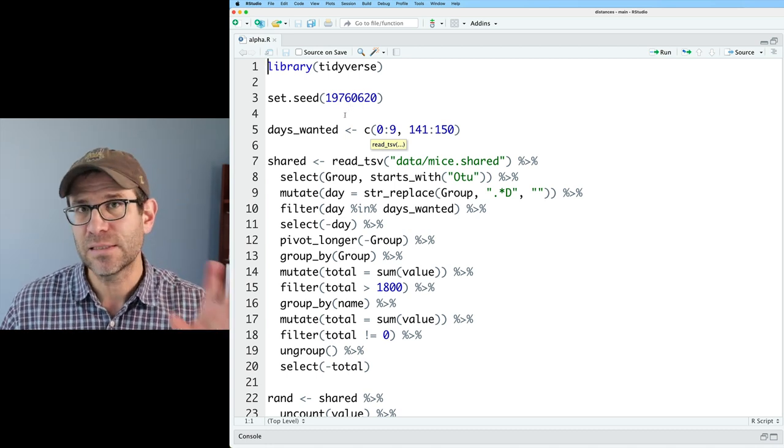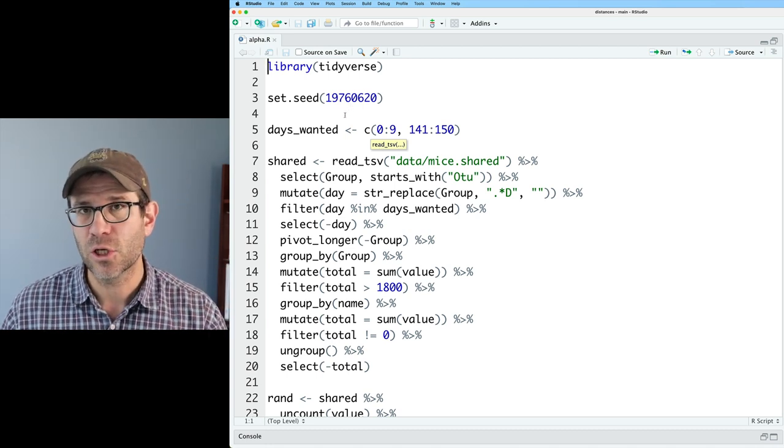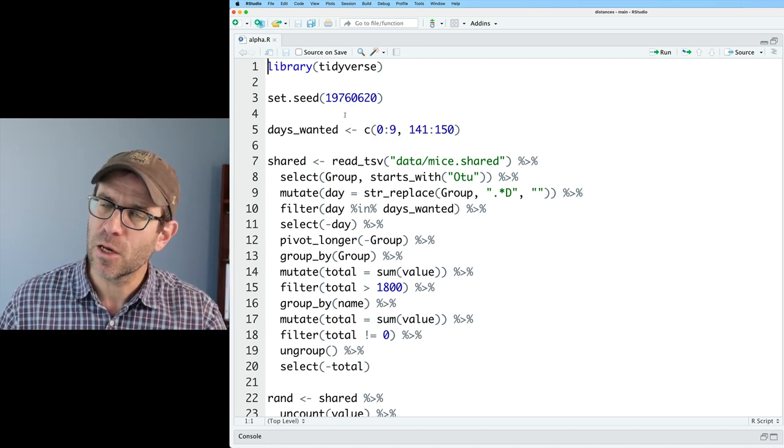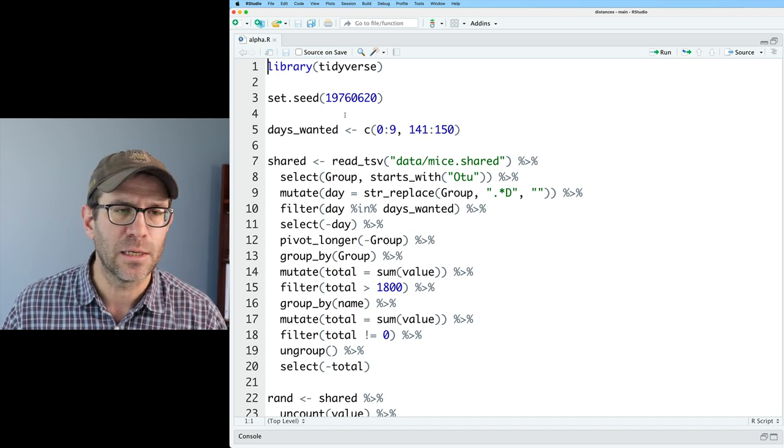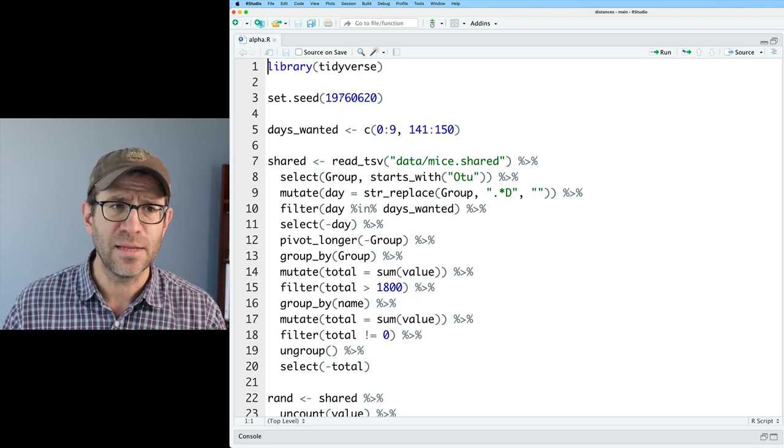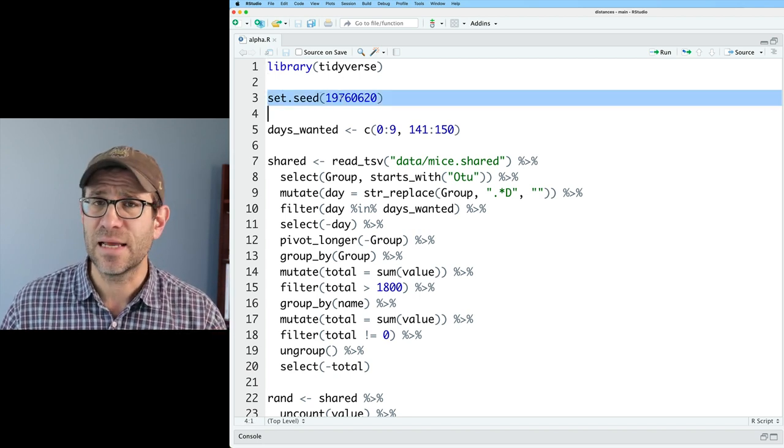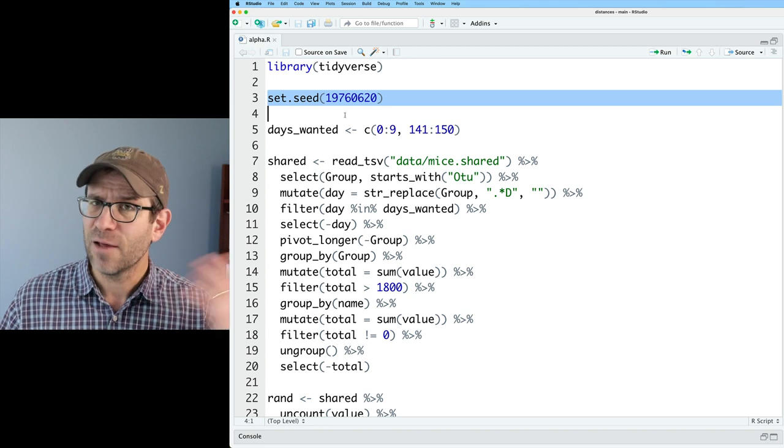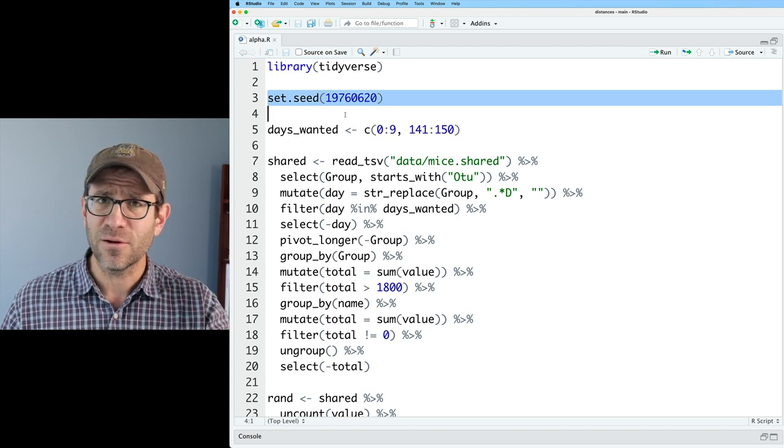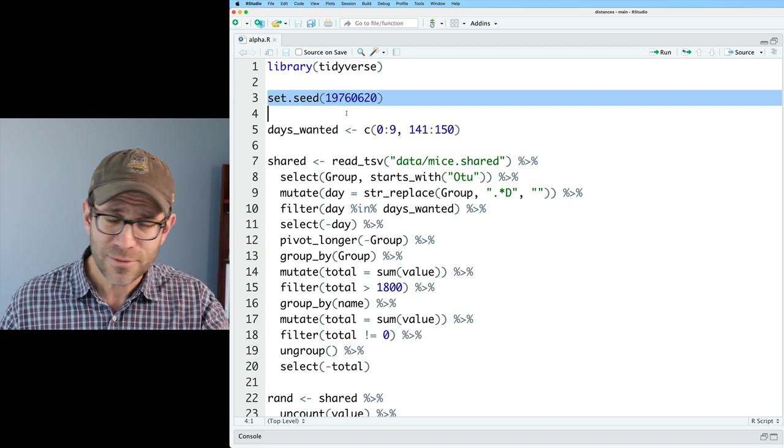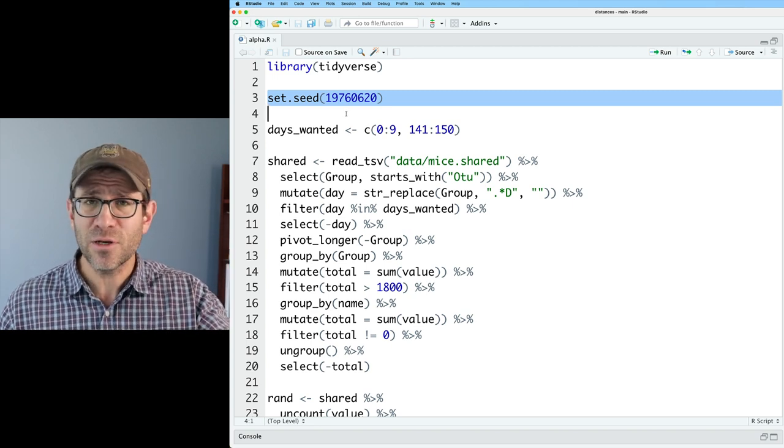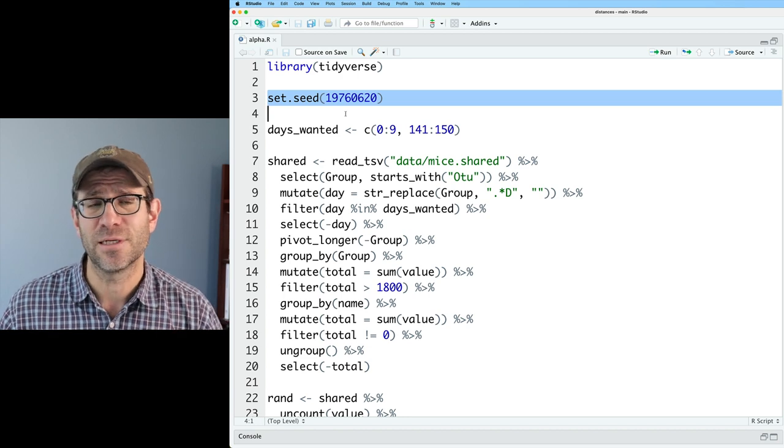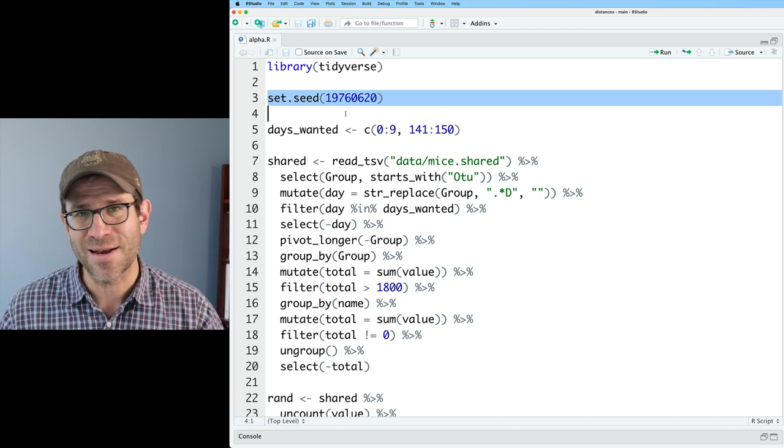As you can see, I've got this alpha.r script that I've created using some of the code that we've been using in recent episodes. I load the tidyverse, I set a random number generator seed. I've been forgetting to do that in all the past episodes, and none of you told me. Anyway, we've got it now.